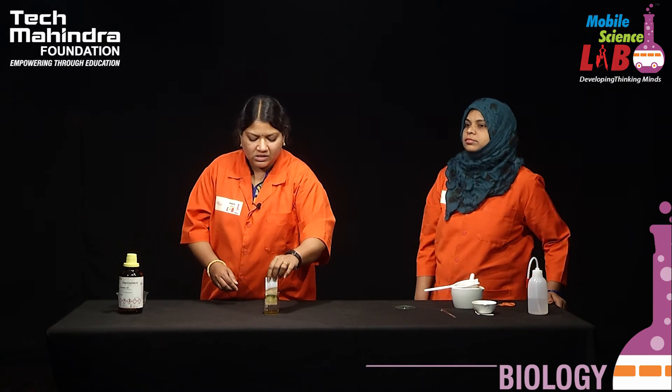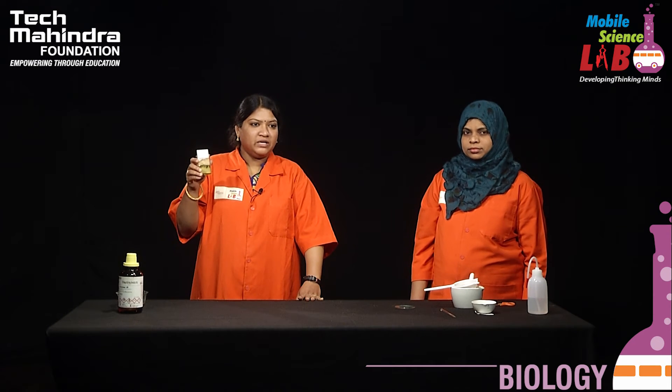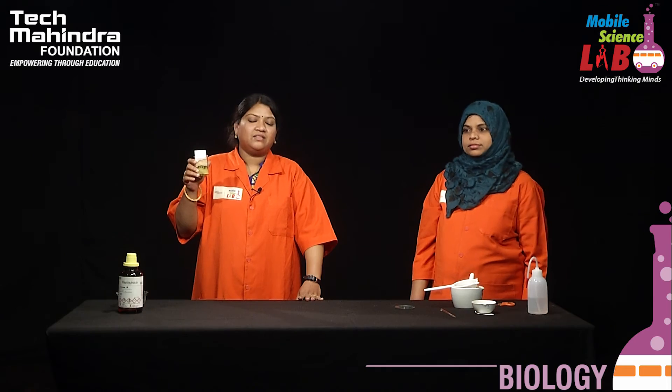Do we need much sophisticated or high-end equipment? No, it is very simple and easy to perform. This is how we have separated the plant pigments by paper chromatography. Hope you all have enjoyed this experiment — please do try it, and thank you.